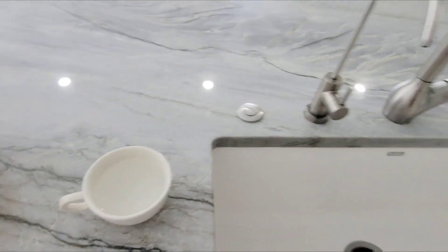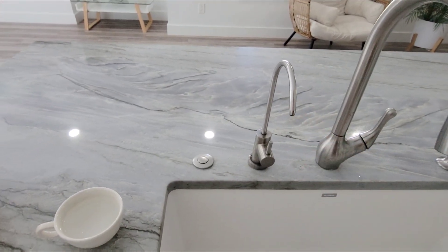The filter makes quite a huge difference. That's incredible.